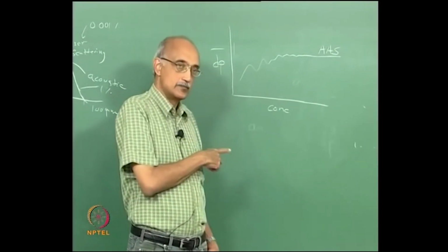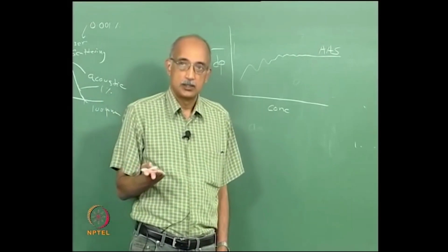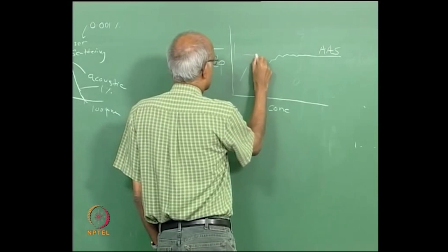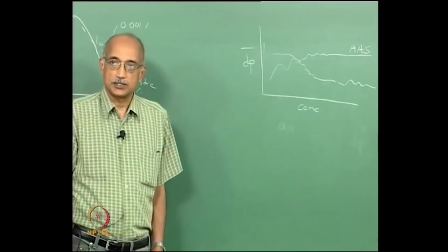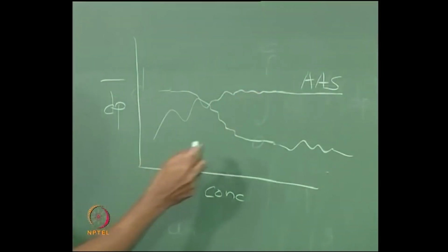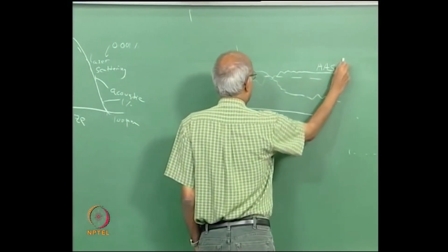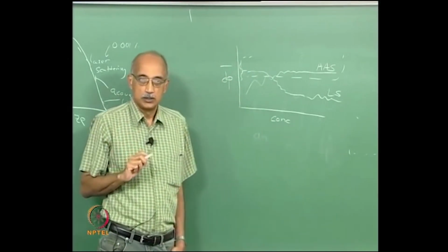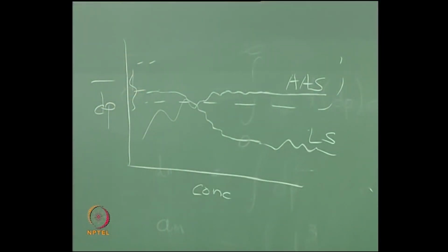If you repeated this in the case of a light scattering device, the trend you will see will be the exact inverse. So what you will find is that you get a behavior which shows significant deviation at the higher concentrations, but gives you very stable data at lower concentrations. Okay? So the stable size that is predicted by both methods will be very close, but if you are not careful you may have measured at the wrong concentration and got completely different values.